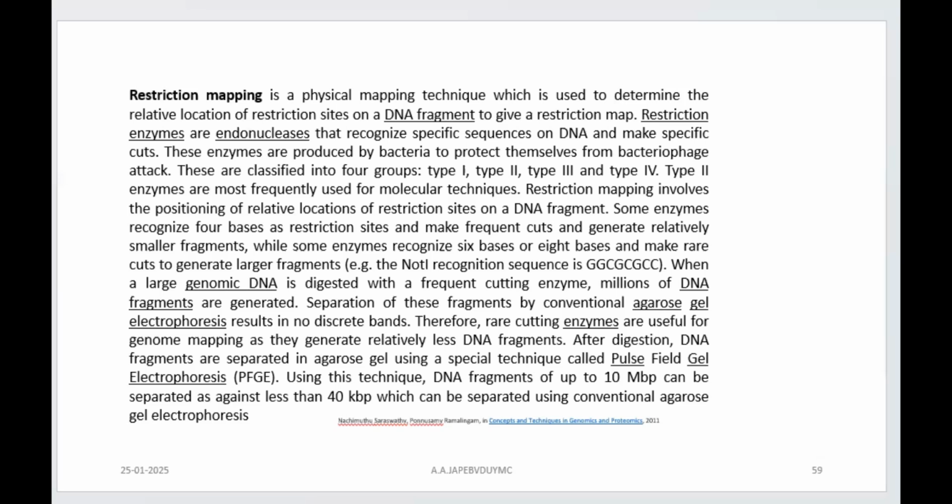Then visualizing these fragments while they are in the gel with the help of ETBR, right? We are talking about DNA, and then estimating their size in relation to the standard run on the gel simultaneously, right? That is what is the ladder that you say, isn't it?